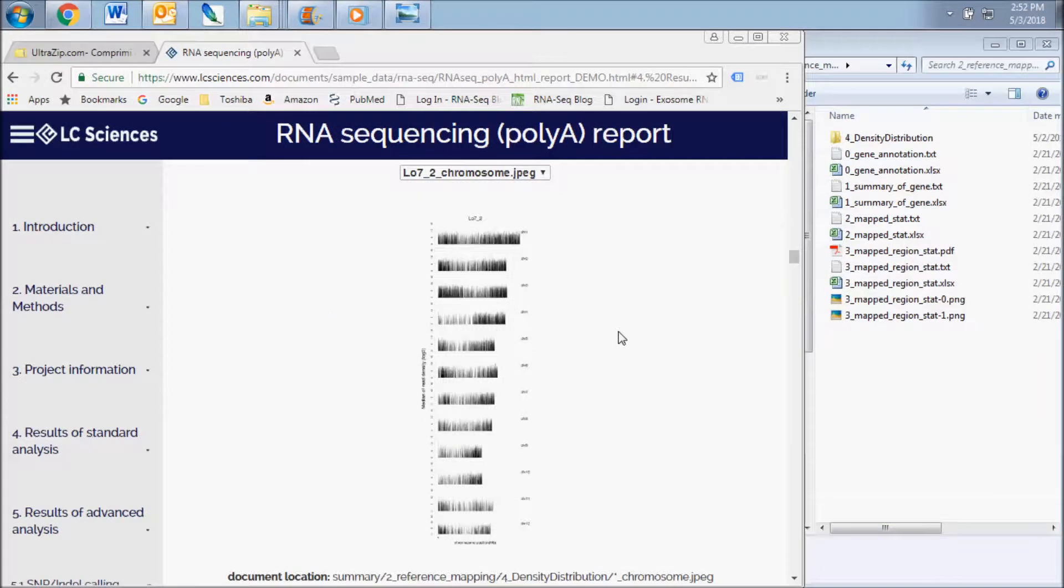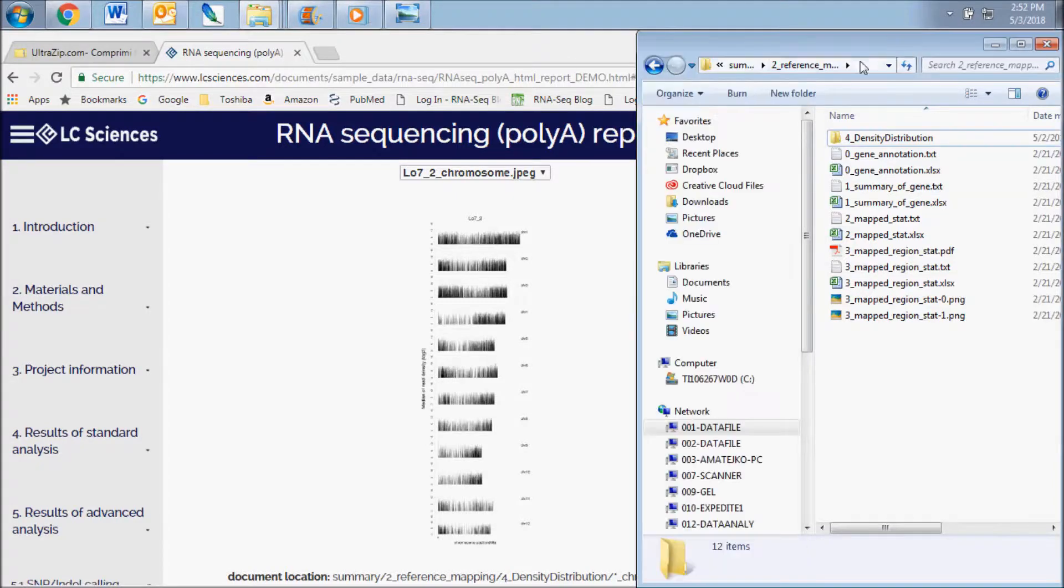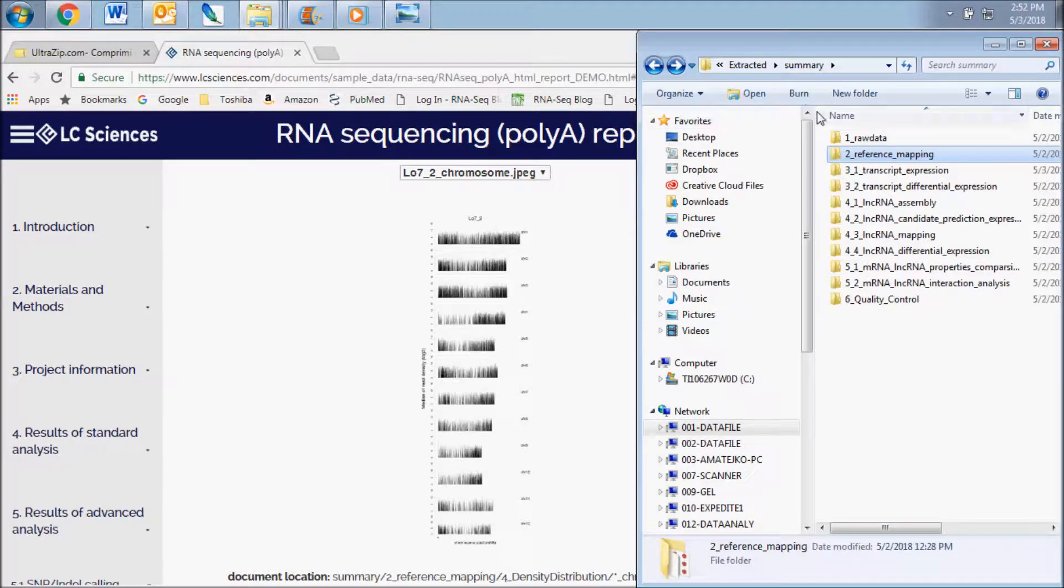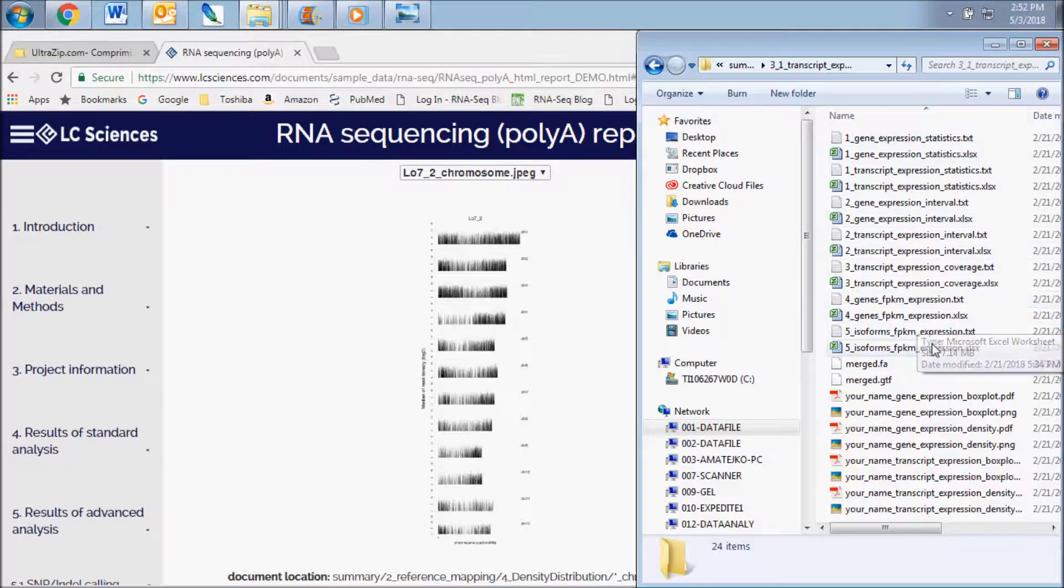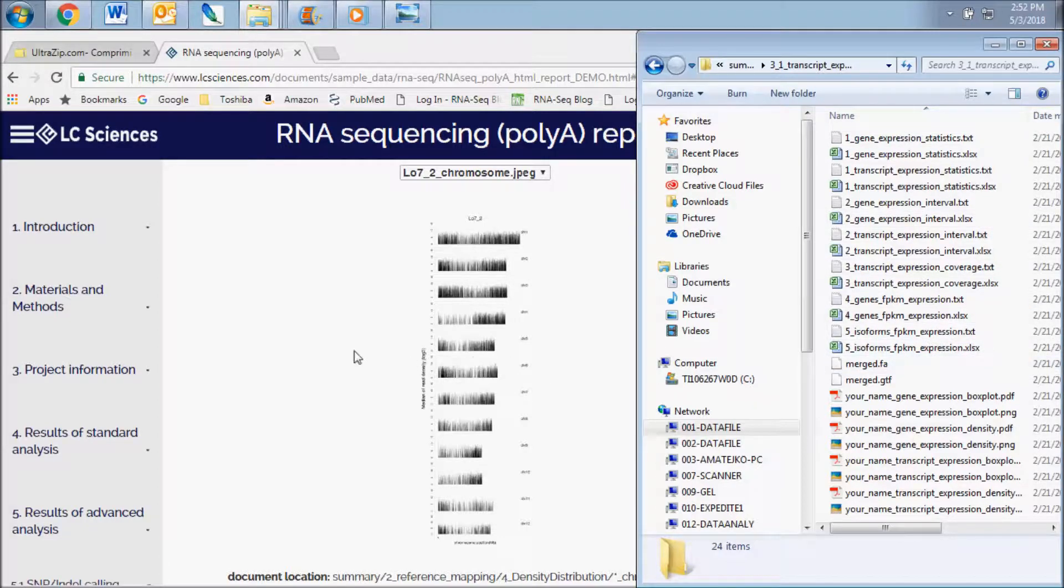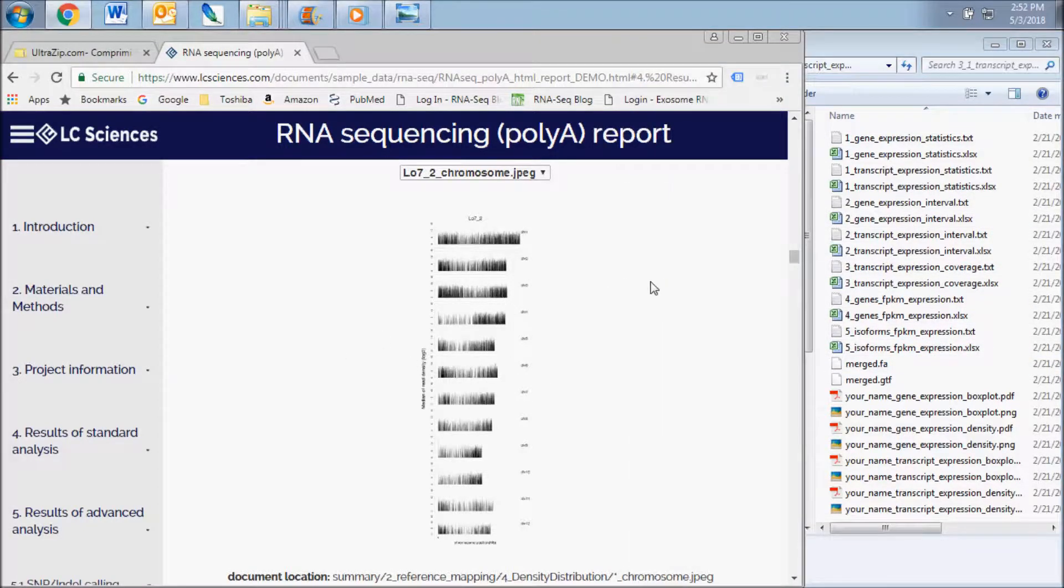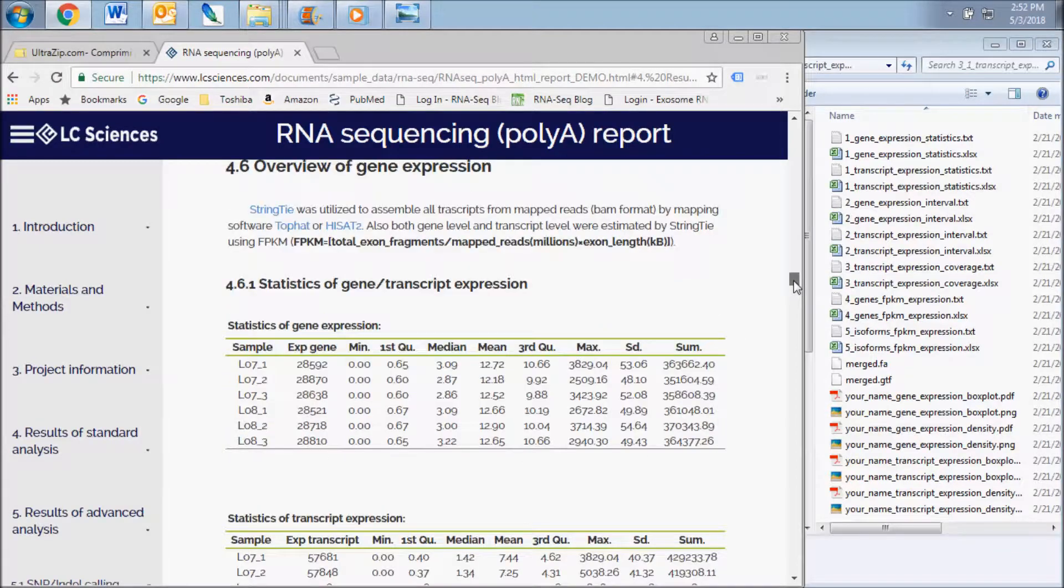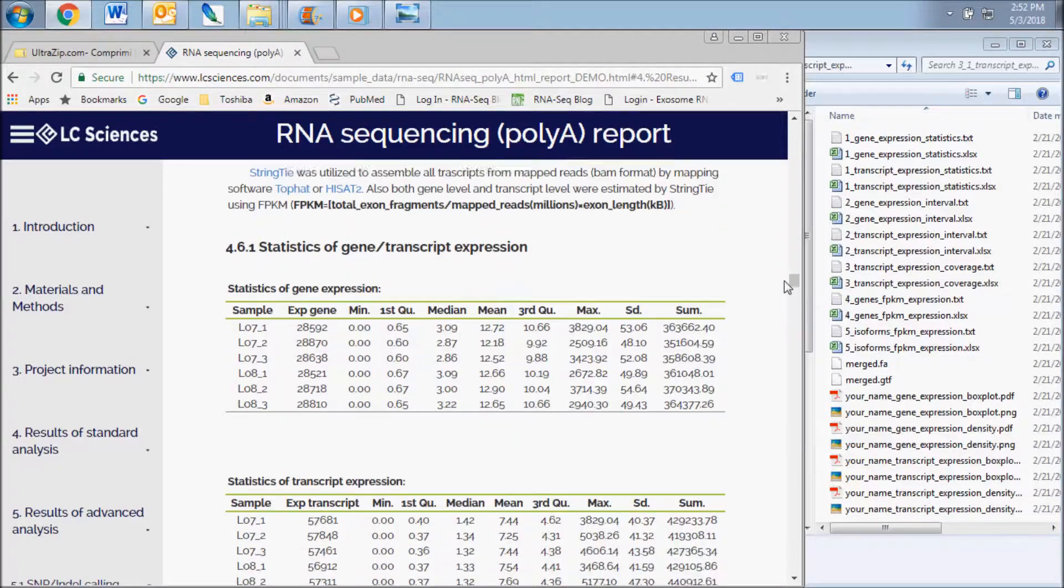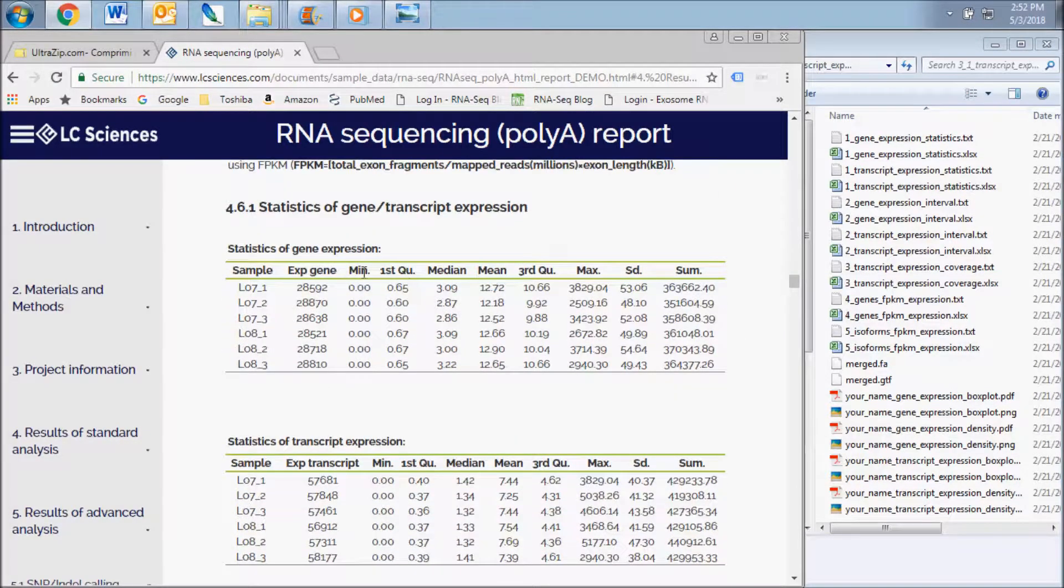The next results subsection displays data contained in the transcript expression data folder. This includes expression data and statistics for both genes and transcripts in each sample. The first two tables show the statistics of the number of raw reads mapped to each gene or transcript.